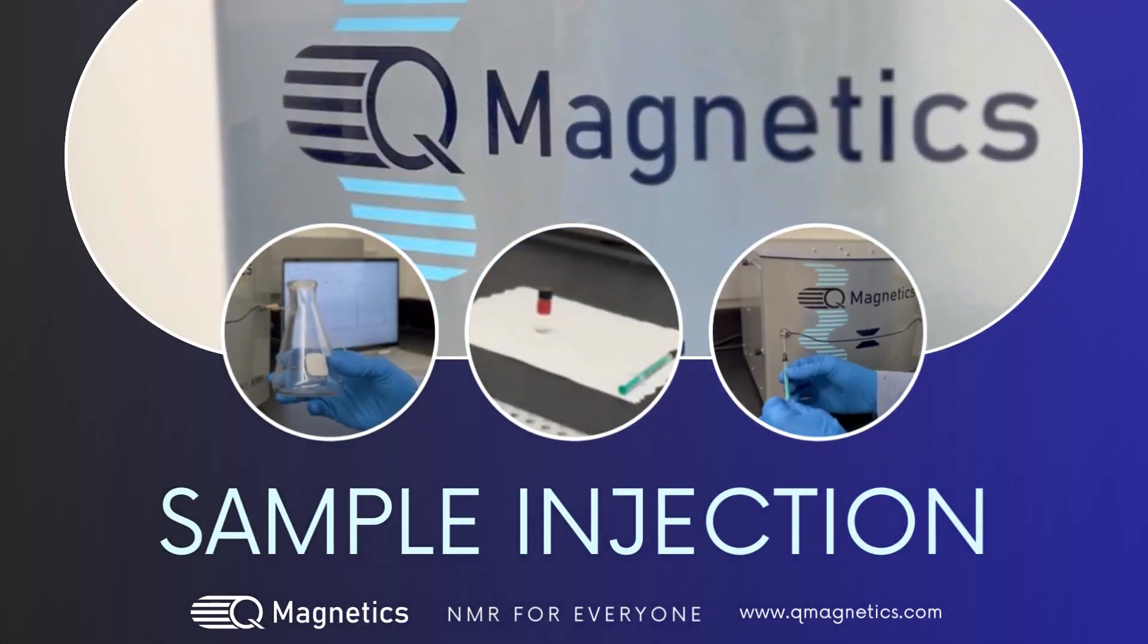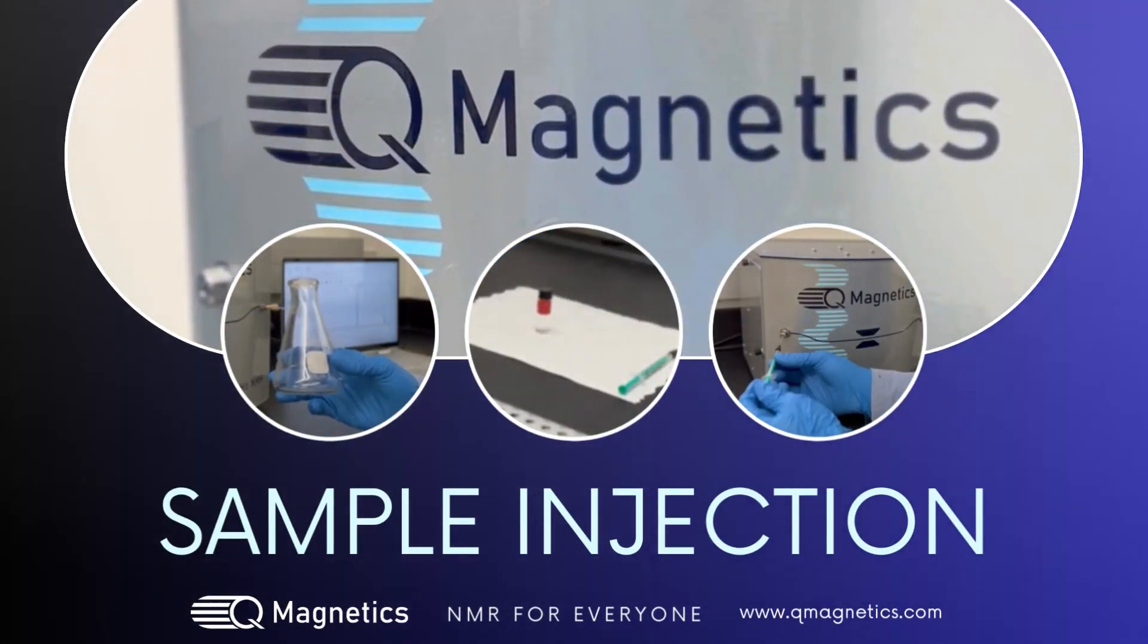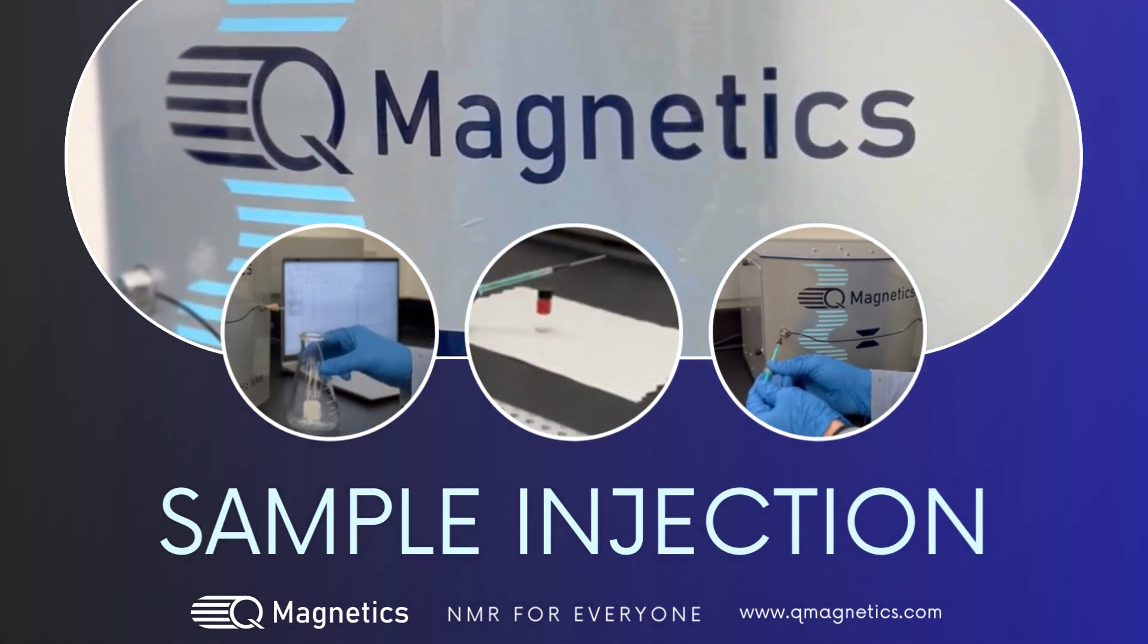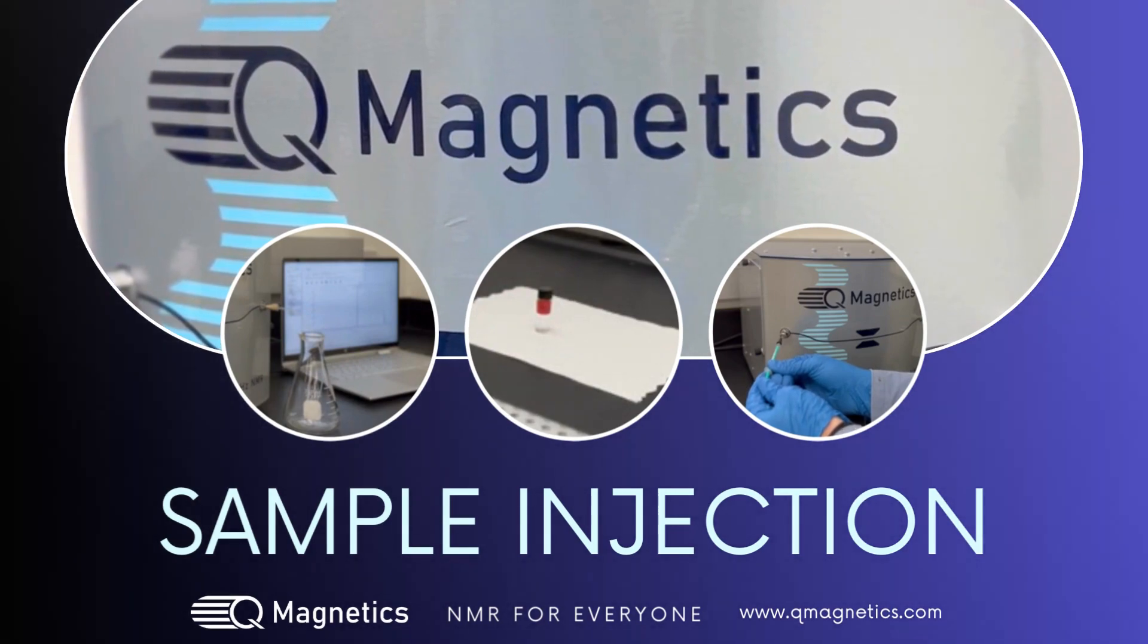Hello. Welcome to this instructional video on the QM125 Benchtop NMR from Q-Magnetics. This video provides a step-by-step guide on sample injection and how to load a sample using the QM125.